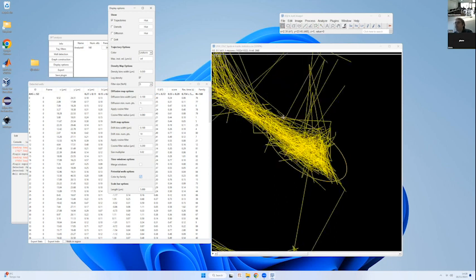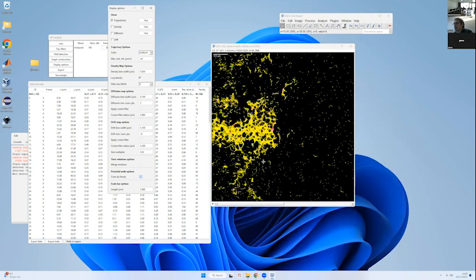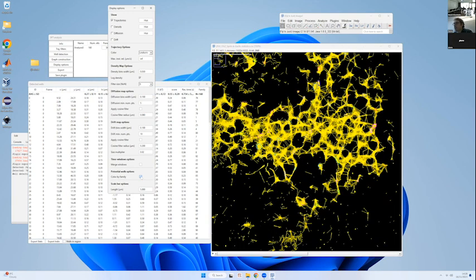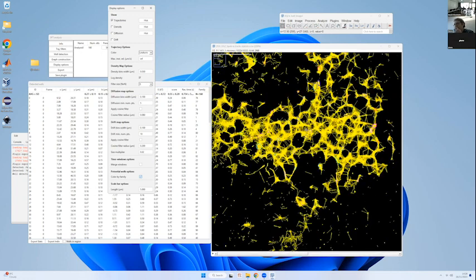Just one second. I think, except you, Cecile, where you didn't click on this option, now you look at the time lapse. At a given time, you have a well, it's colored, and then you can go to the next frame in time to see if the well persisted.